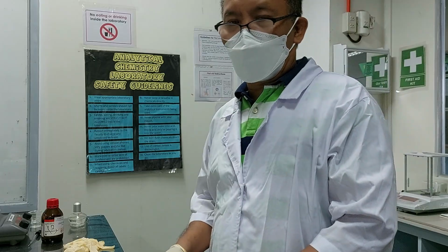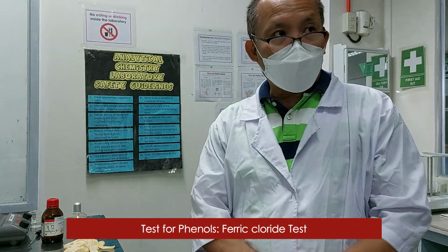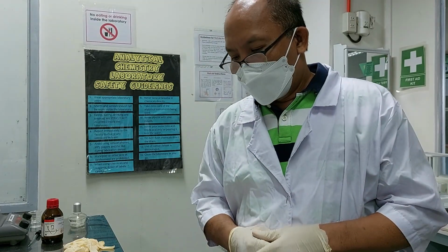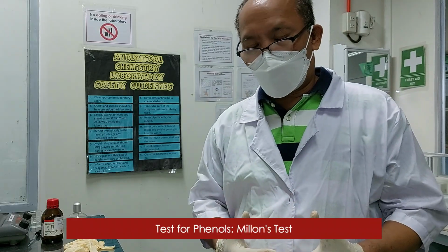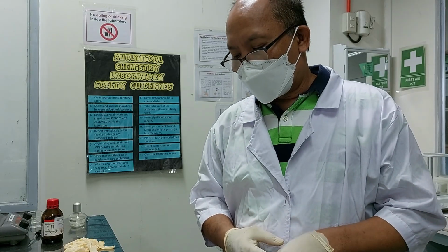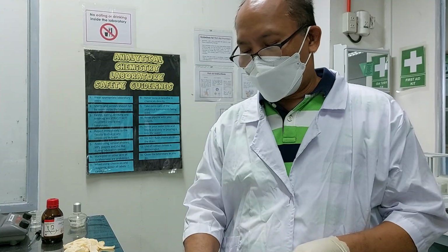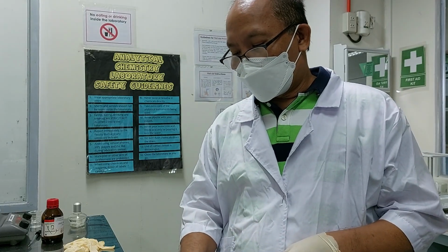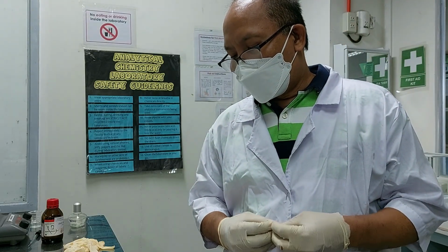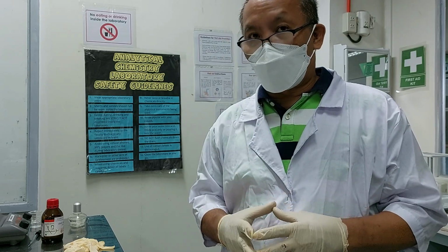So how are we going to identify the presence of phenols or aromatic compounds? There are two tests that we're going to do. One is the ferric chloride test. The ferric chloride will react with phenol to form complex compounds, so we'll observe various colors. The second one is the Millon's test. The Millon's test contains mercury, the mercuric ion, as one of its major components. Check the reagent, because this comes out in the board exam for pharmacy. For phenolic compounds, Millon's test will give a bloody red color.